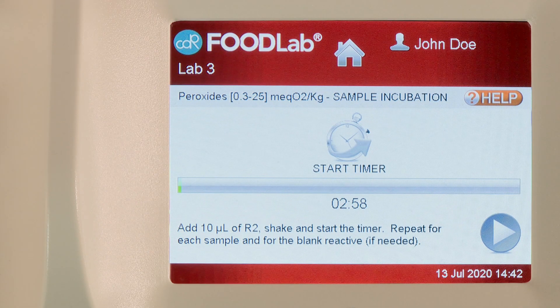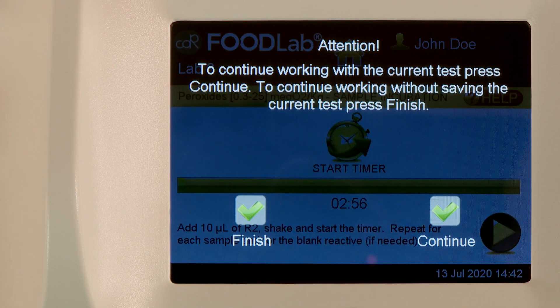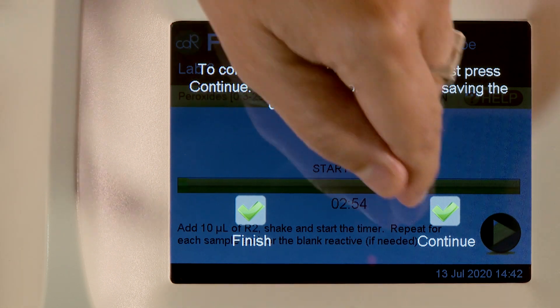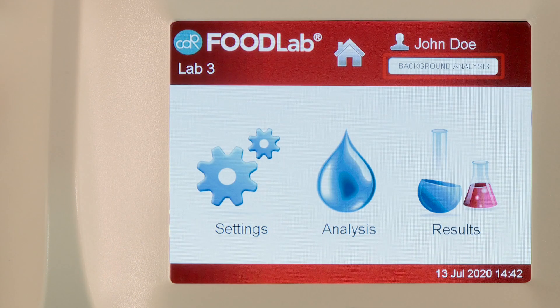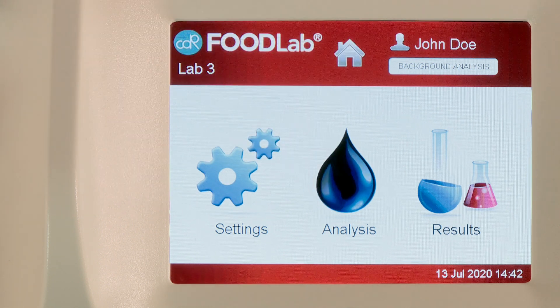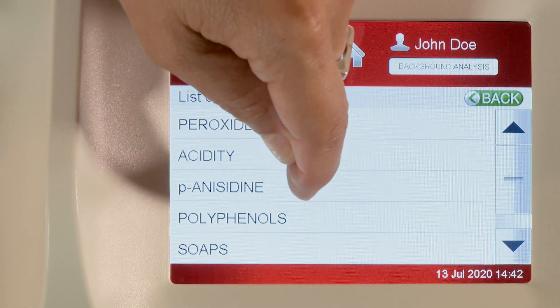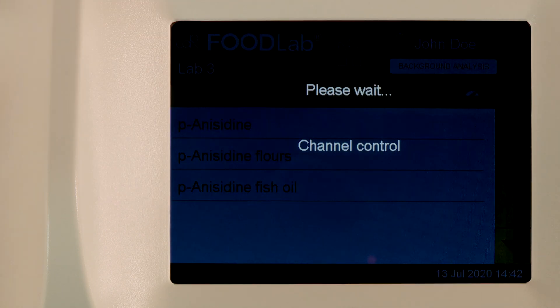Meanwhile, press Home to go to the second analysis. On the black alert screen, press Continue. The Background Analysis button appears. At this point, select the second analysis from the menu.